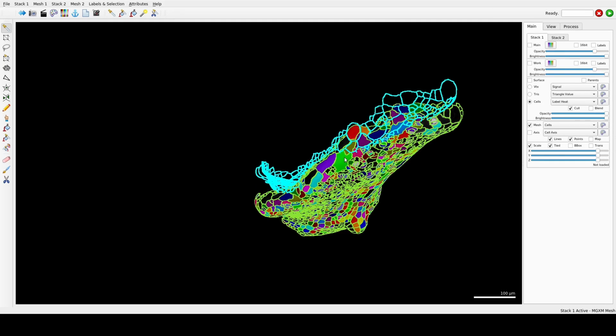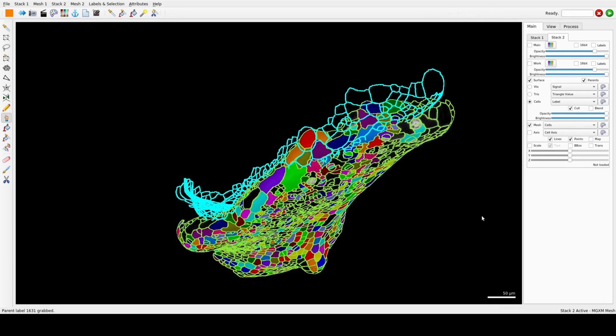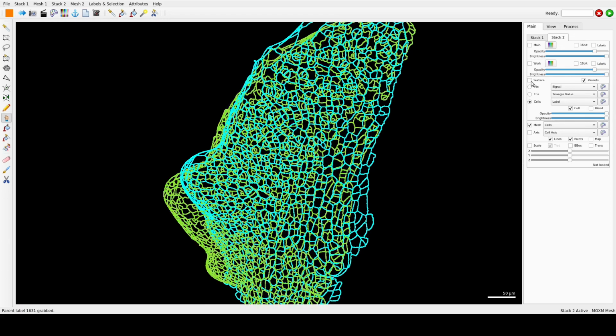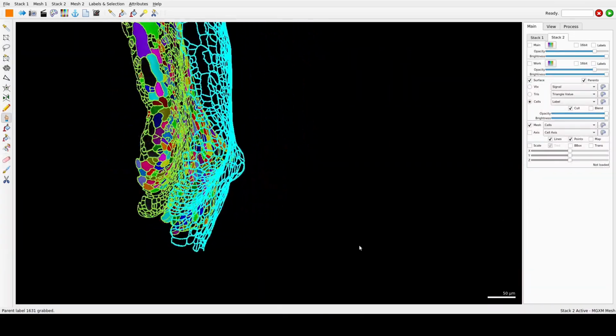So we have this one here, we can fix. Then we can fix some on this point here.